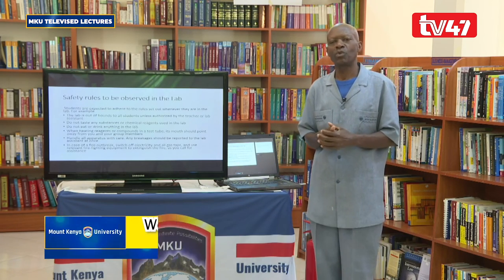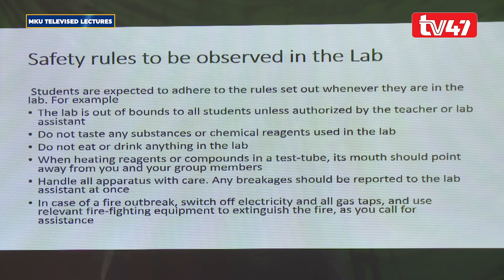Then lastly, safety rules that you and I, all the students, should observe when working in the biology lab. They are expected to adhere to those rules that protect them. We shall just have a quick look at some examples. One, the biology lab is out of bounds to all students unless authorized by either the teacher or the lab assistant. Secondly, you should not taste anything in the biology lab, whether it is edible or inedible.